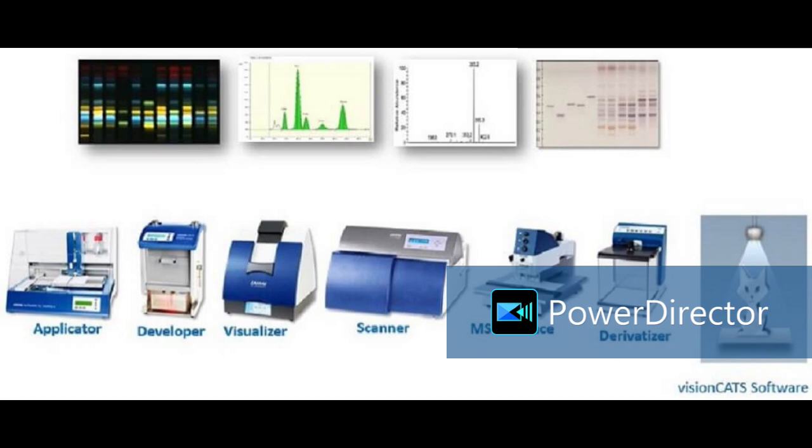And for derivatization, we are using automatic spray derivatizer. So it will generate a very fine mist or aerosols of the liquid derivatizing reagent. Only 2 to 3 ml reagent is required to derivatize the plate. That mist will settle down onto the plate, homogeneously derivatizing the plate without intervention of user. And after spraying the plate with derivatizing reagent, it will suck back all the vapors generated in this hood. So it is a green technique also, eco-friendly technique also. Only 2 to 3 ml reagent is required.